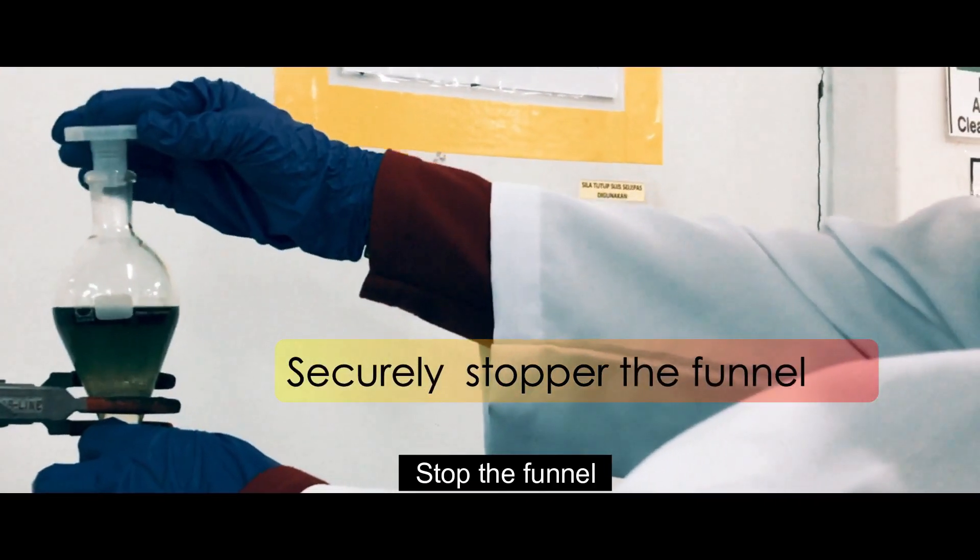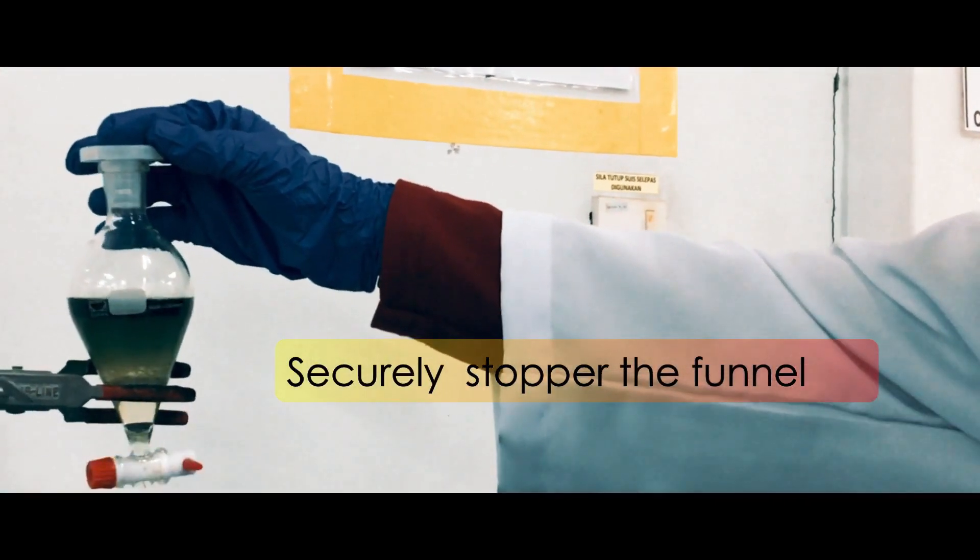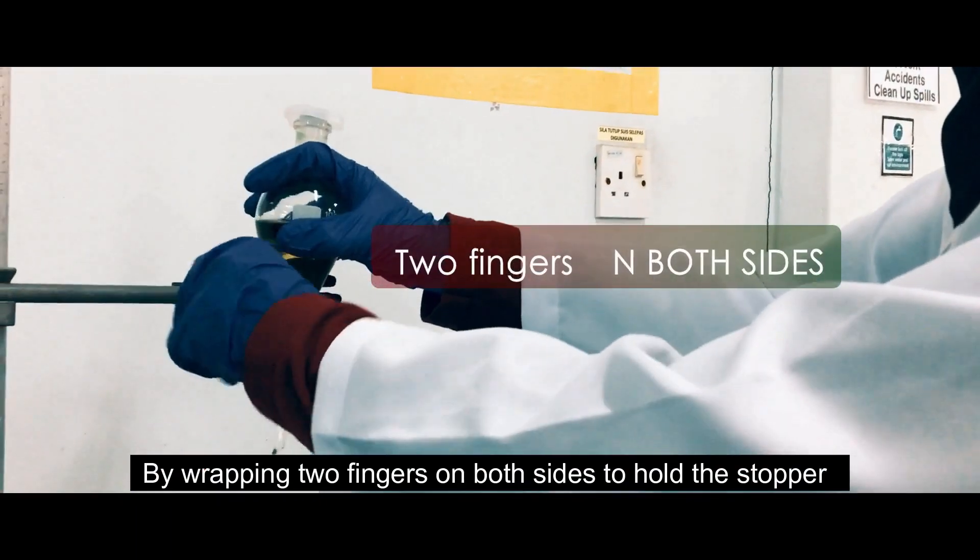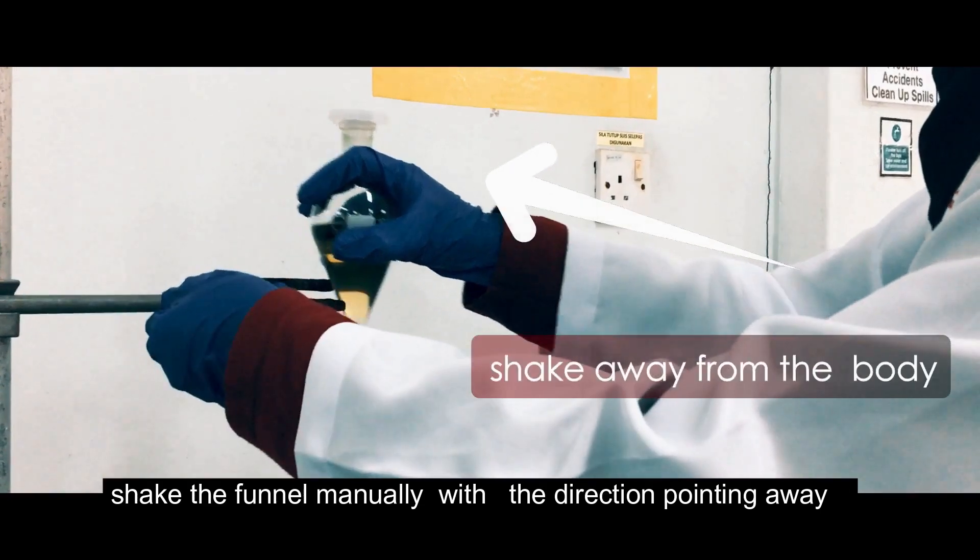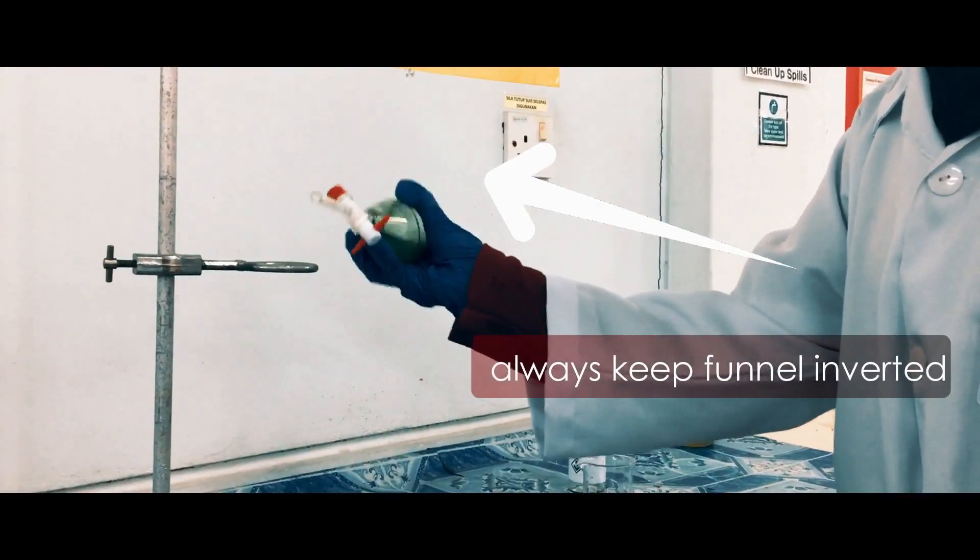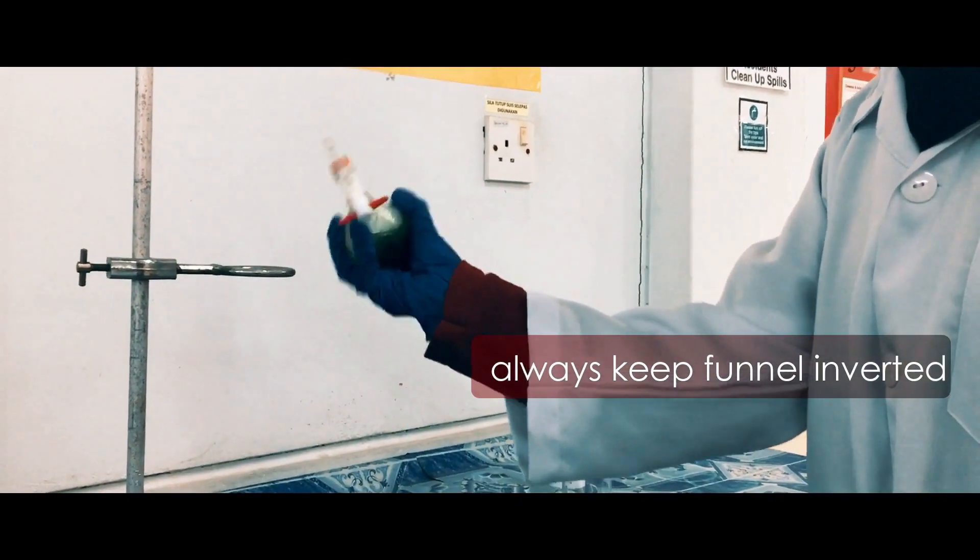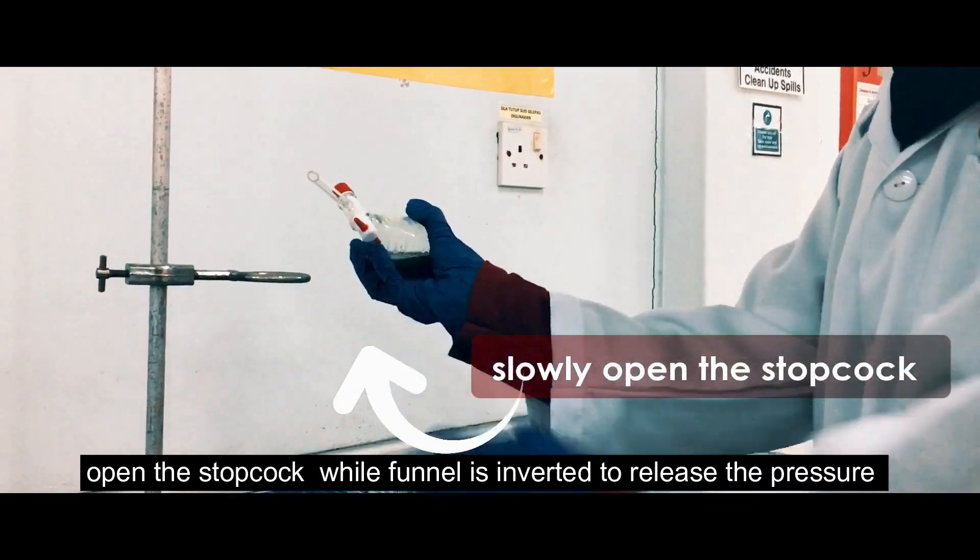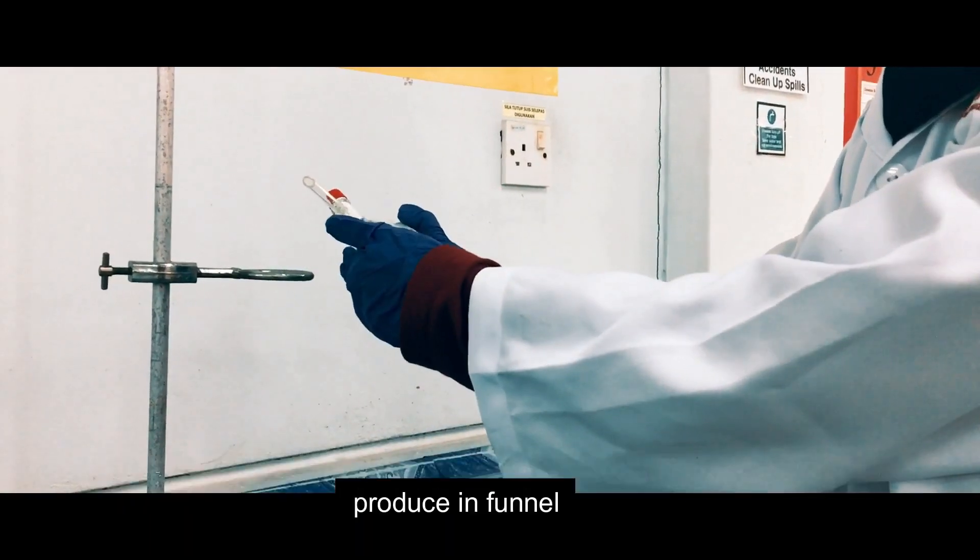Stop the funnel. By placing finger on both sides, hold the stopper. Shake the funnel manually with the direction pointing away from your body and your lab partner. Open the stopcock while funnel is inverted to release the pressure produced in funnel.